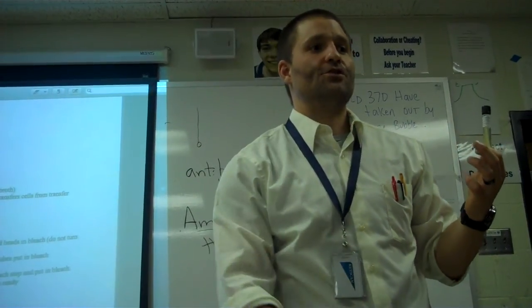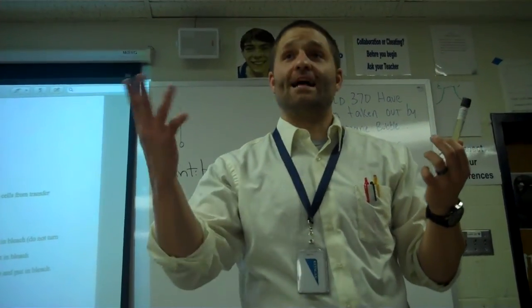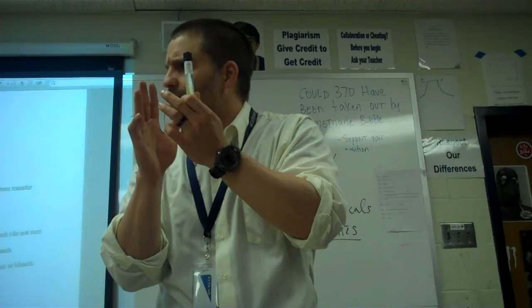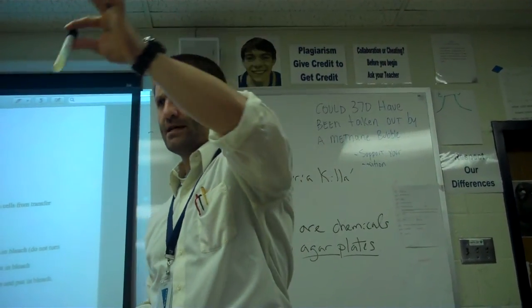So all you have to do is put the plasmid in there and do the other procedures. This may be tweaked slightly once I get in here on Sunday and start working on this, and we may have to change things a little bit, but this is what I'll be doing. Everybody cool with this? Yes.